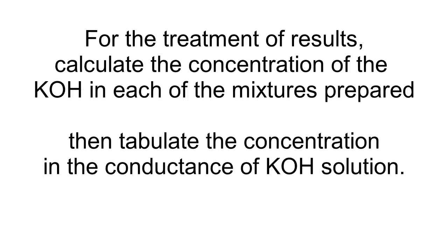For the treatment of results, calculate the concentration of potassium hydroxide in each of the mixtures prepared. Then, tabulate the concentration and the conductance of the potassium hydroxide solution.